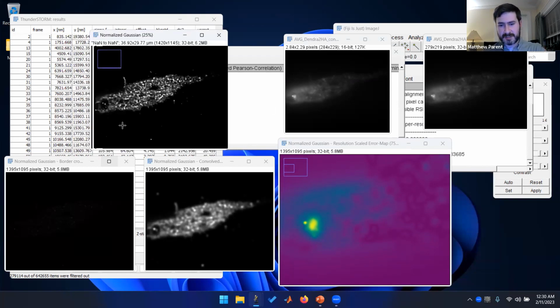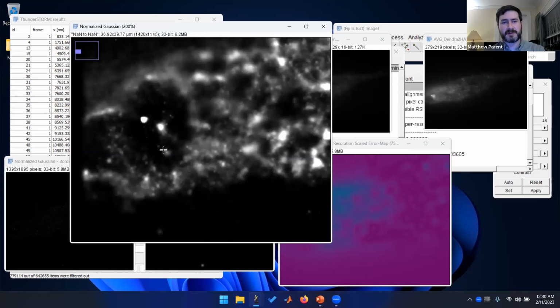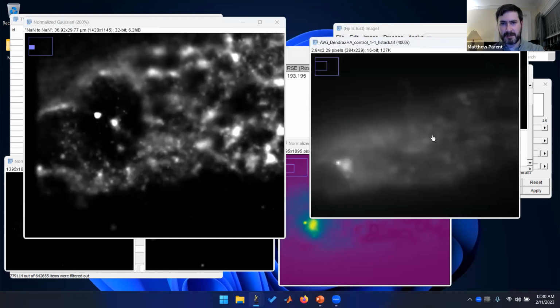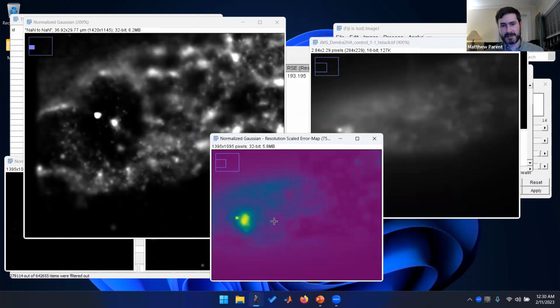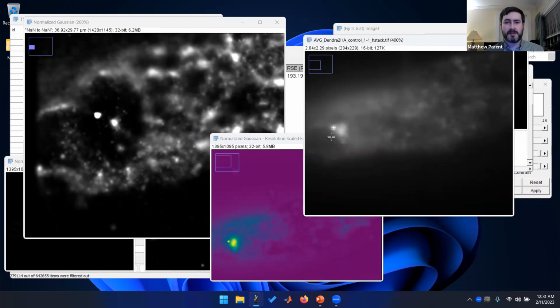And I chose this particular data set for a reason, because you can see here in the super resolved case, you have this sort of big black hole with a couple of dots in the middle. And in the diffraction limited image, you have this big blob here. And that's where NanoJ Squirrel is telling me I might have a problem with this green yellow color coding here. And the reason I might have a problem here is because I probably did not sample this structure. What likely happened, and we could always go back to the raw data and see, is that too many molecules were on at once. In other words, this was probably a very deep, very dense cluster.